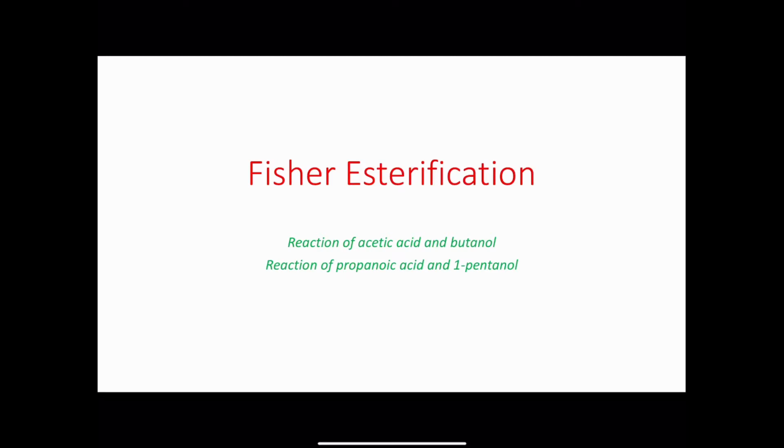So in this video, we're gonna talk about the Fischer esterification reaction. And we have the reaction between acetic acid and butanol, and the other one between propanoic acid and 1-pentanol.